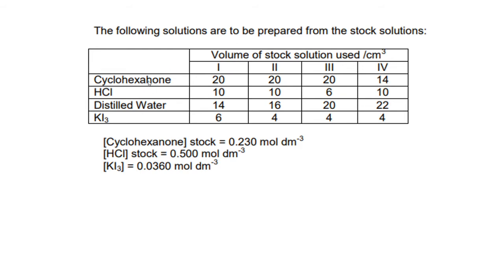So this is wrong spelling. Anyways, what's the point? You need to monitor what happens when you keep 3 parameters constant and the rest are changed. That is the whole point, and see whether that has an effect.